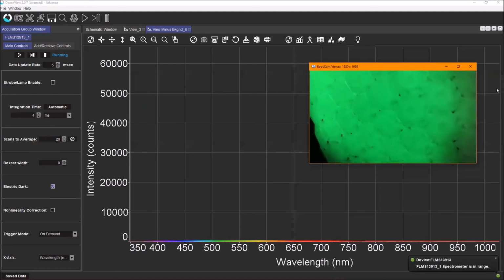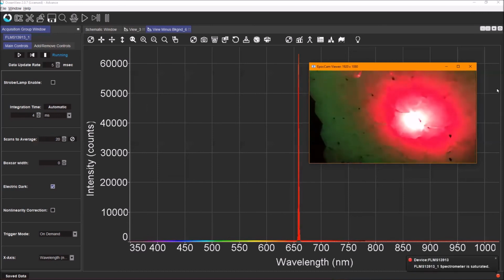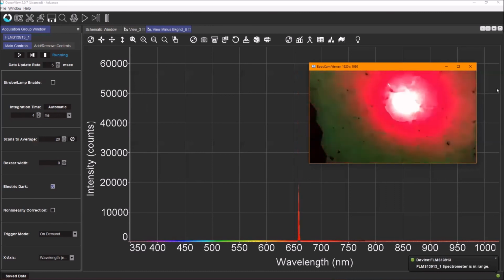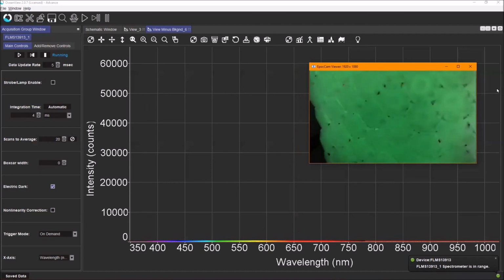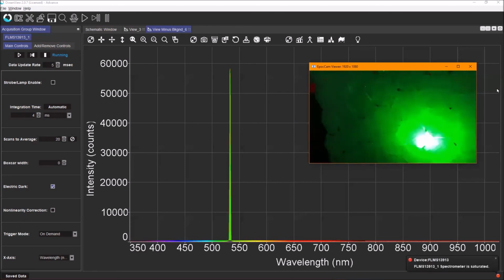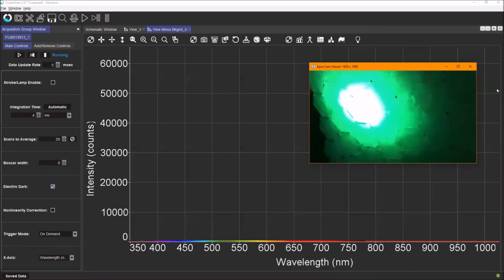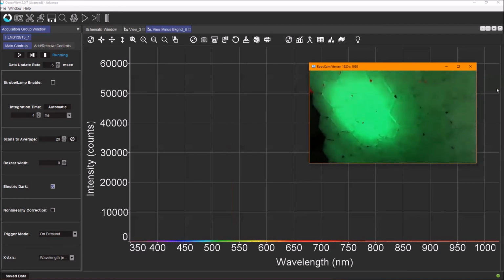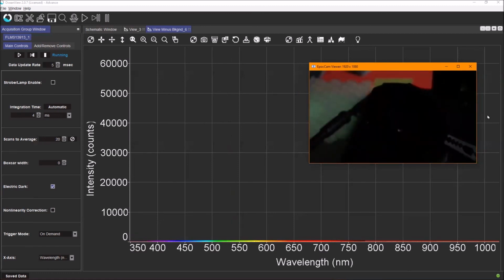Now, I can try to light this up with lasers. This is a red laser. Doesn't do anything. I can do it with green laser. There's no phosphorescence from that light. Only when I use UV light does it turn on brighter. Impressive.